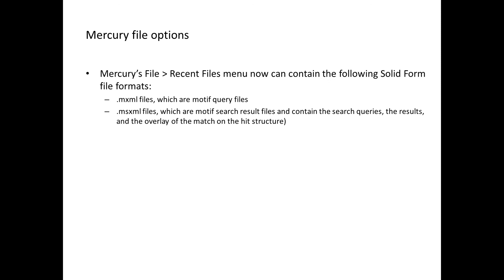Mercury File Options. Now Mercury's File Recent Menu can contain the following solid form suite file formats: .mxml files, which are the motif query files; .msxml files, which are motif search result files and contain the search queries, the results, and the overlay of the match on the hit structure.